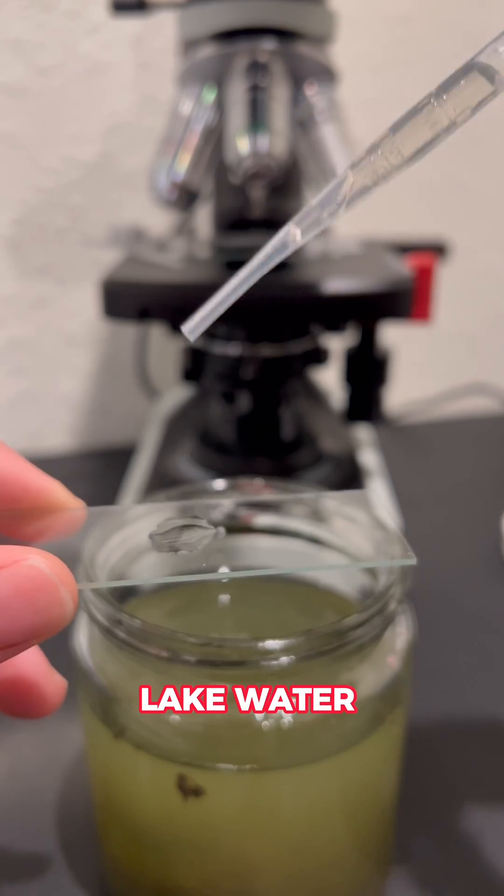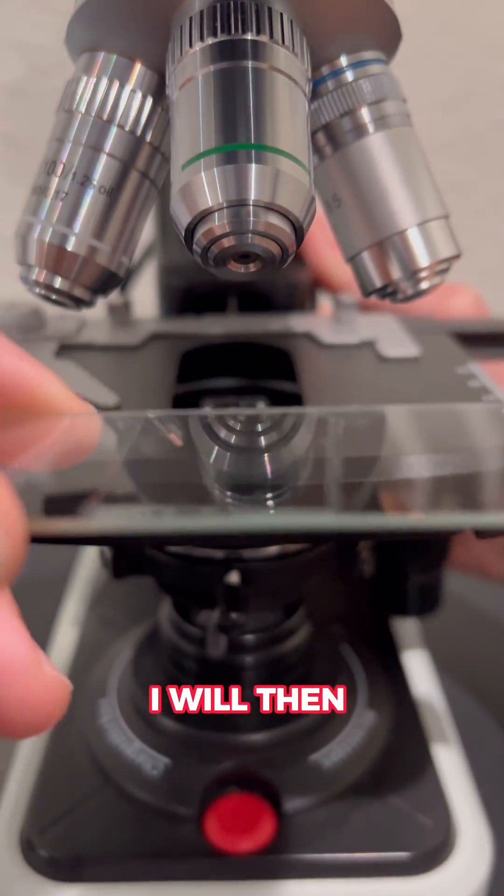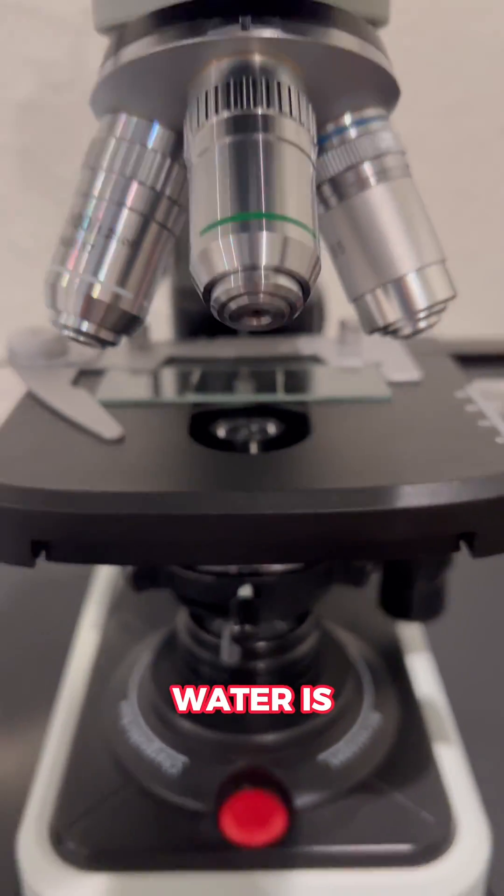After putting a sample of lake water on a glass slide with a cover slip, I will then put it under the microscope to see why this water is so nasty.